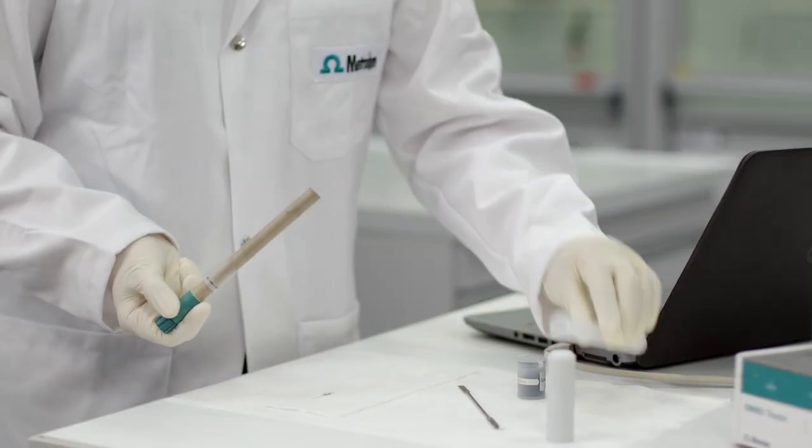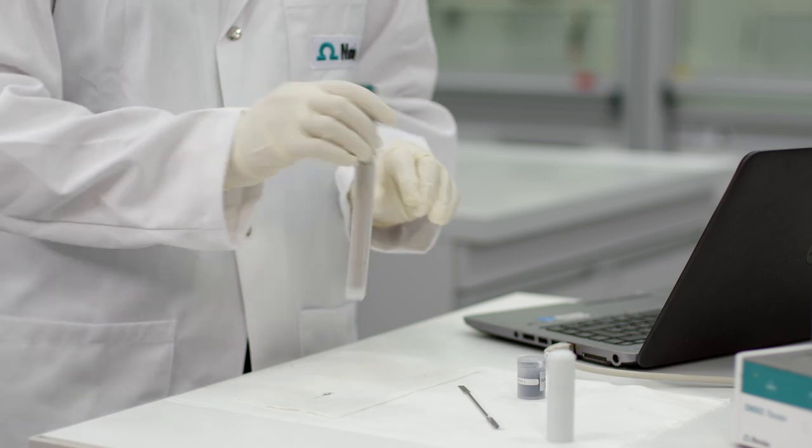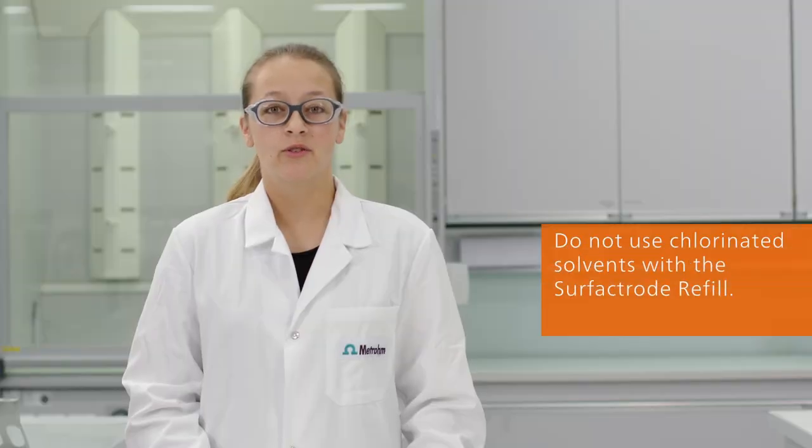Finally, don't forget to store the electrode dry after a series of titrations. Be aware that the Surfactrode Refill is not resistant to chlorinated solvents.